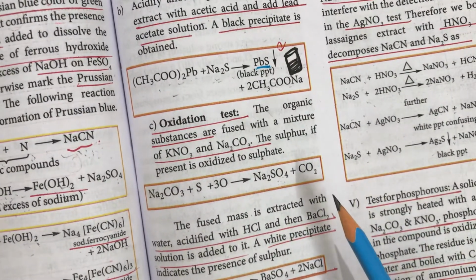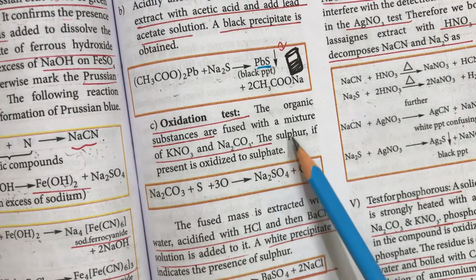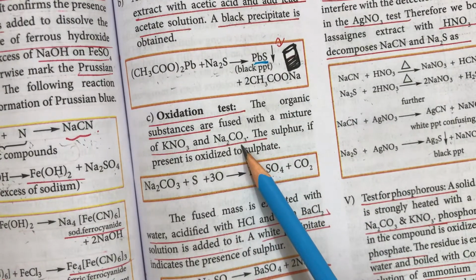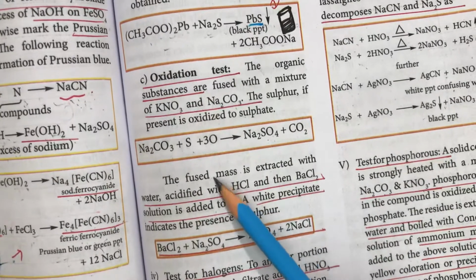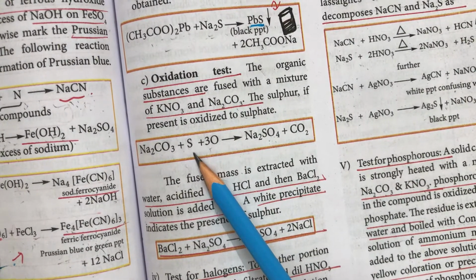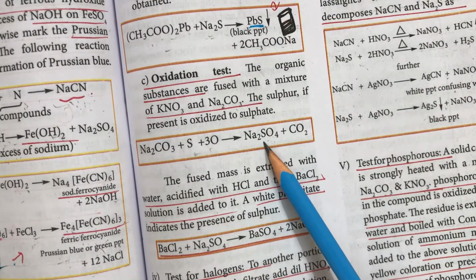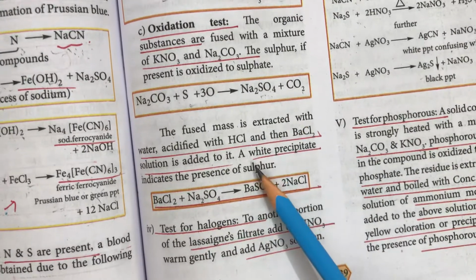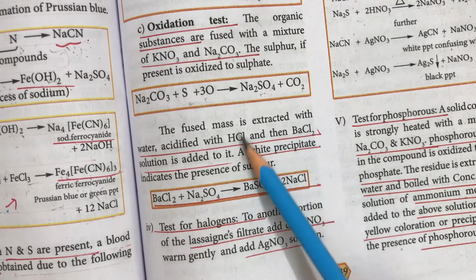Another test to identify sulfur is the oxidation test, where the organic substance is directly heated with potassium nitrate and sodium carbonate. The sodium carbonate and potassium nitrate react with the sulfur present in the organic compound, forming sodium sulphate and carbon dioxide. To that, we have to add hydrochloric acid to acidify it.